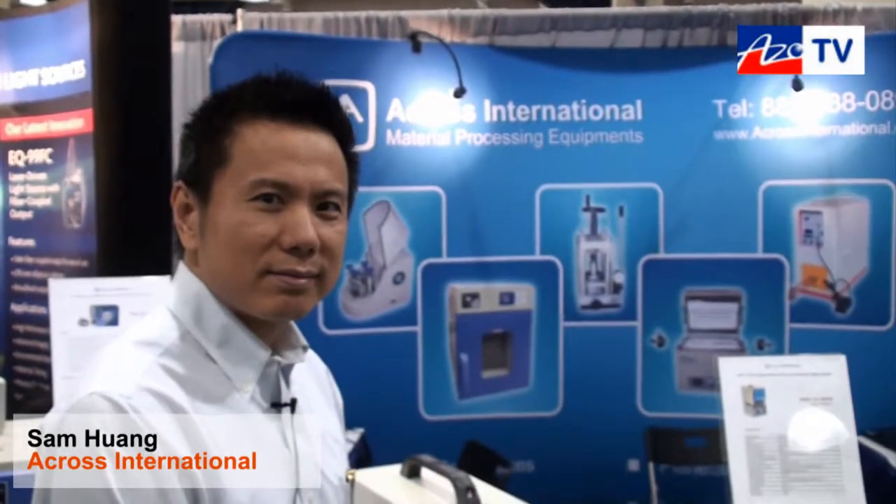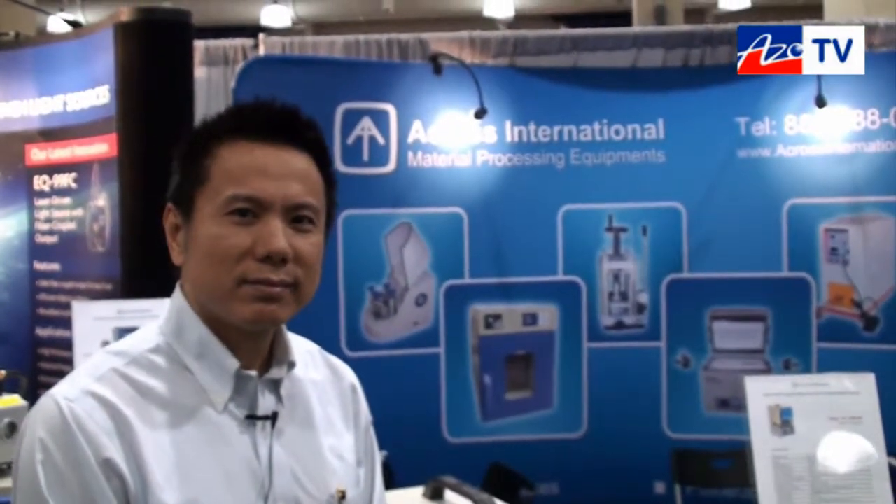This is Cameron Choi bringing another episode of AzoTV, and today I'm speaking to Sam Huang from Across International. He's going to tell us about their IH15A induction heater.